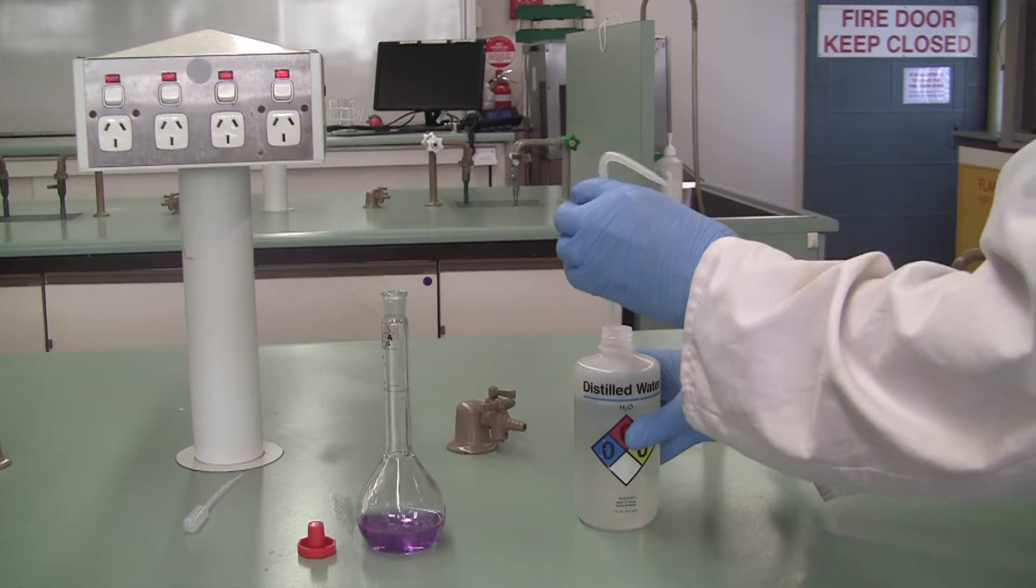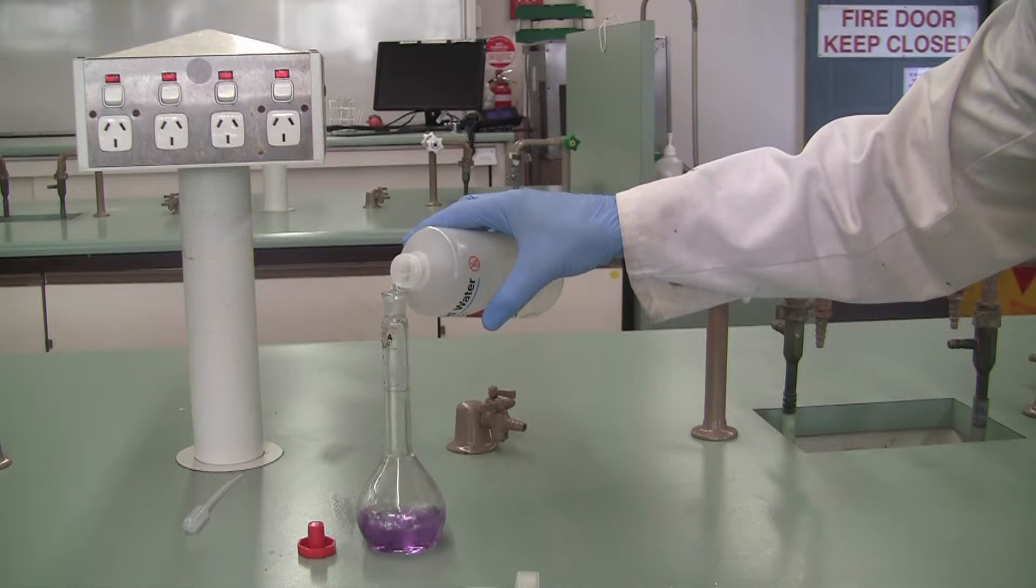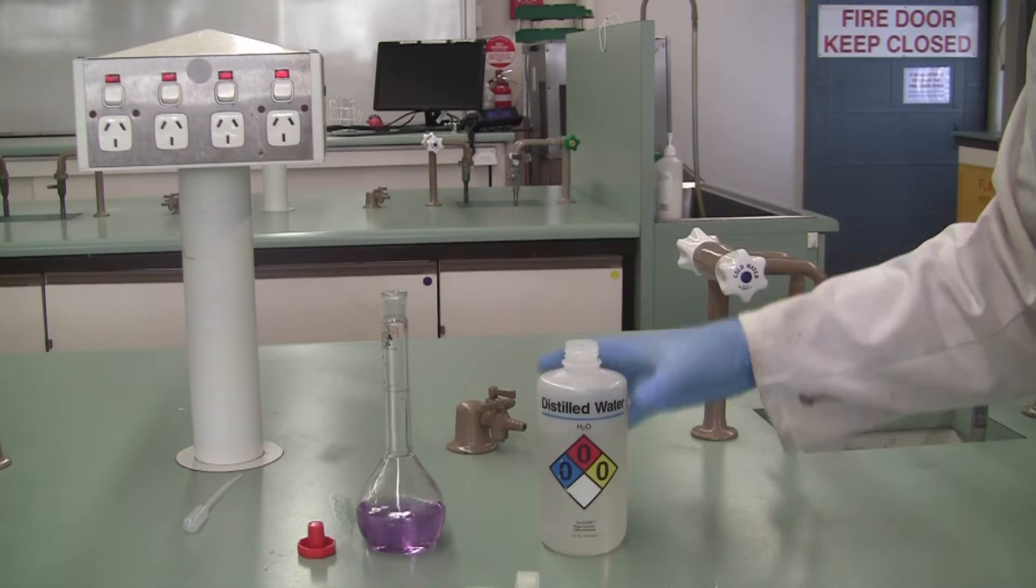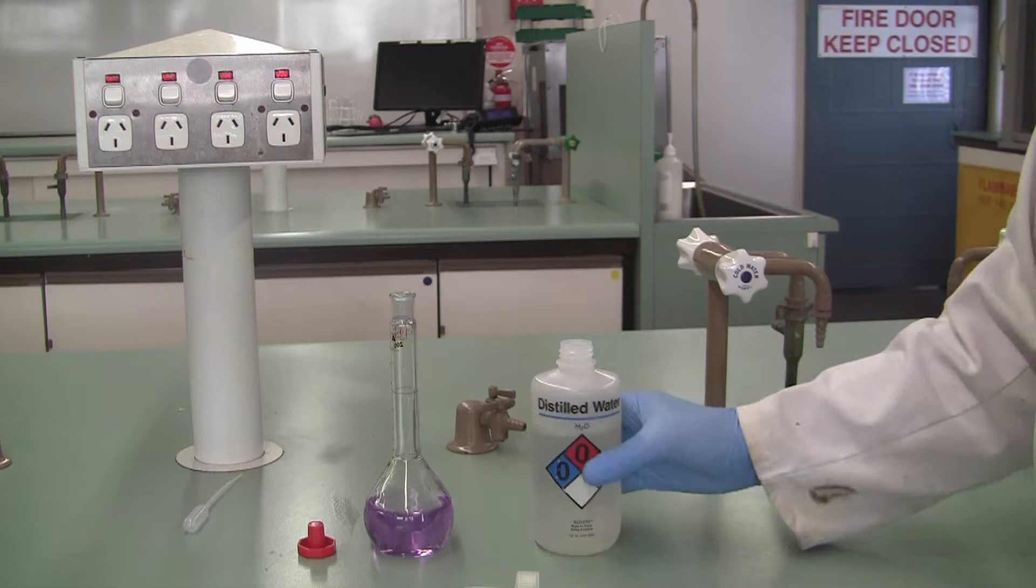So once you've got your sample in your standard flask, get your wash bottle, take the lid off and add 20 or 30 mil portions. As you add each portion, pick up your flask and give it a swirl to make sure you're mixing as you go.